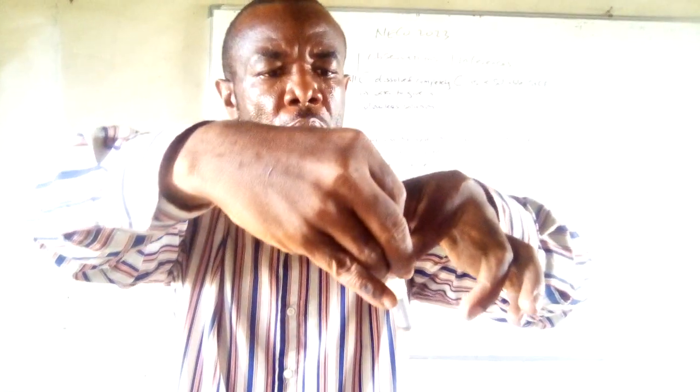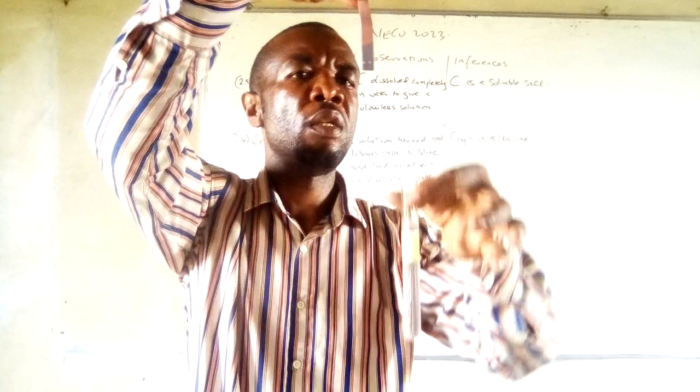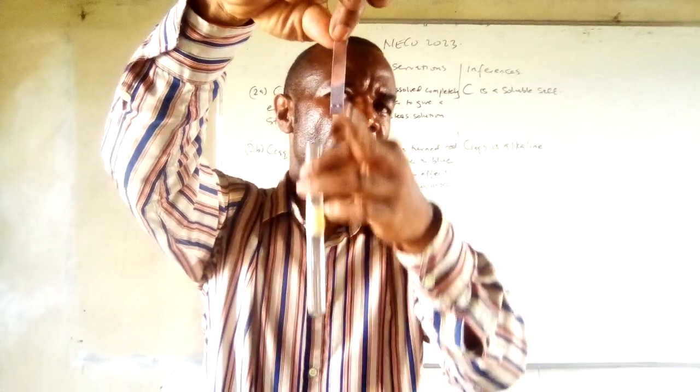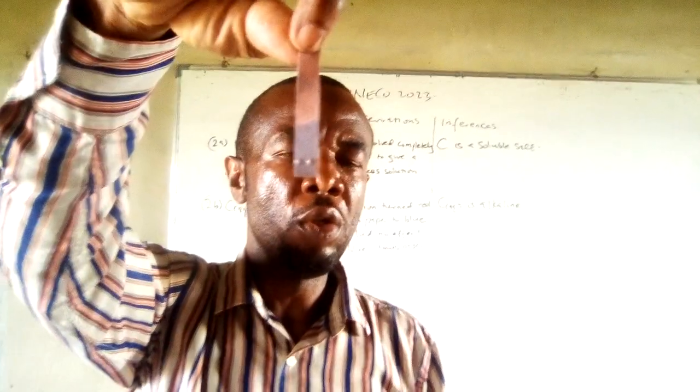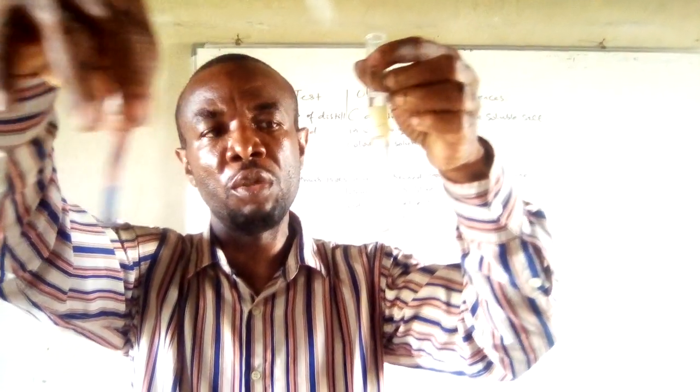Then there is an effect, yes. Look at this part. So I change it to blue. That means this solution is alkaline or basic. There is no need to test it again with blue litmus since it changed red to blue.